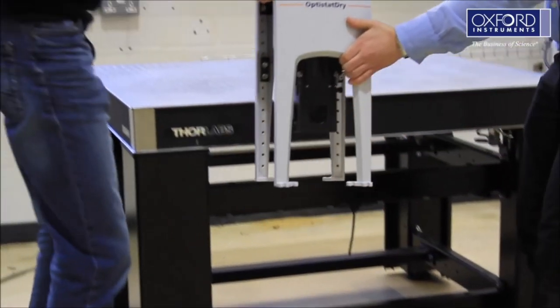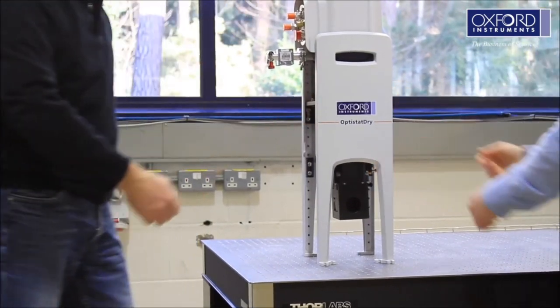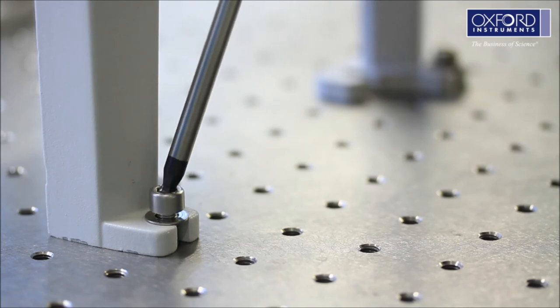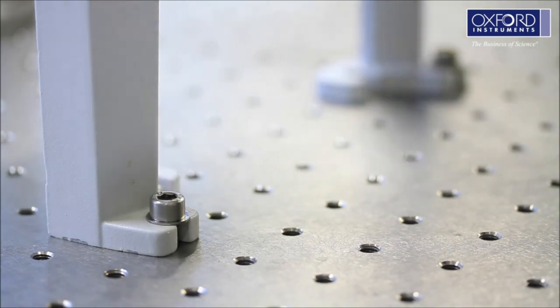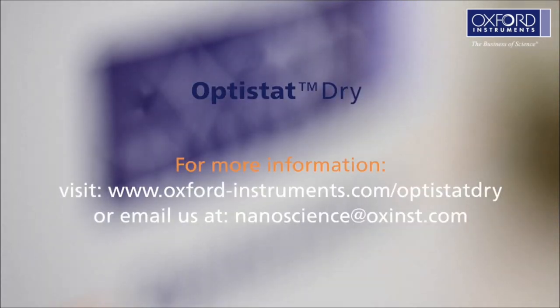Lift the entire assembly onto the optical bench. This will need two people. It is really important to secure it to the optical bench as this assembly is top heavy. If you want any more information, see our OptistatDry videos or visit our website.